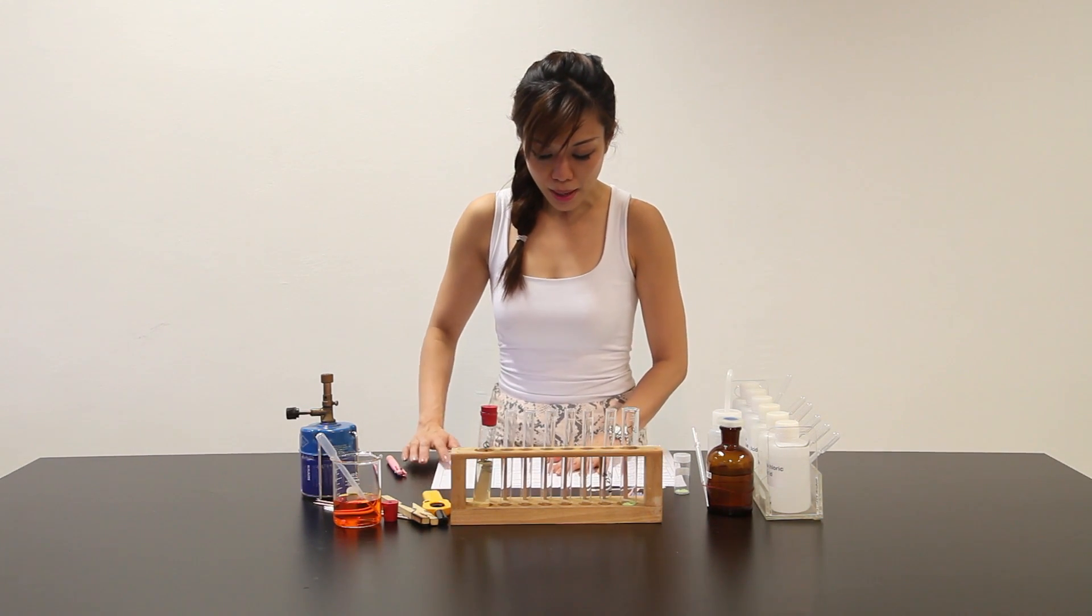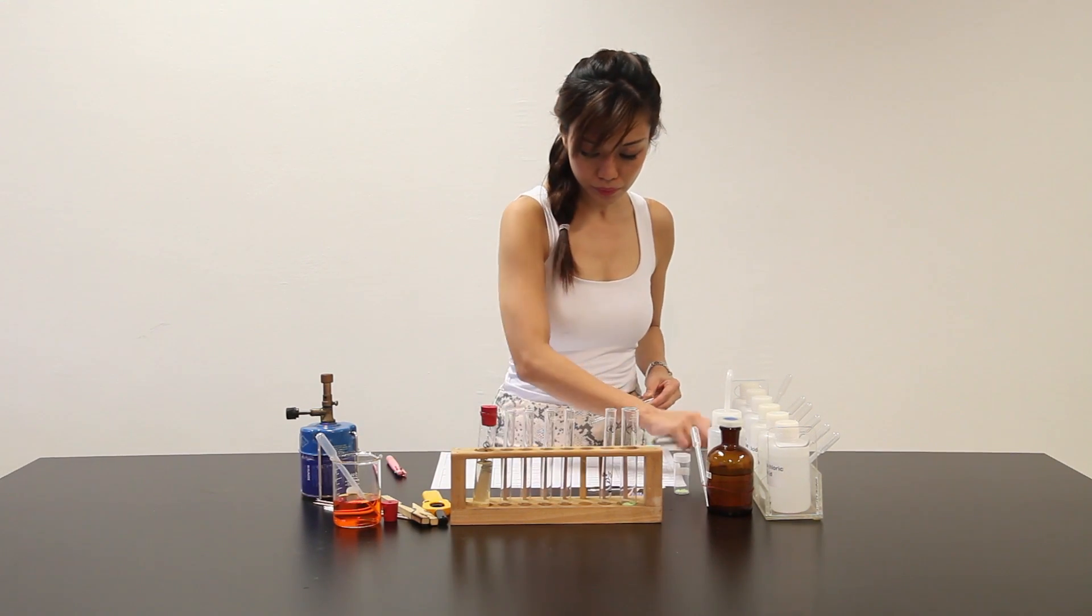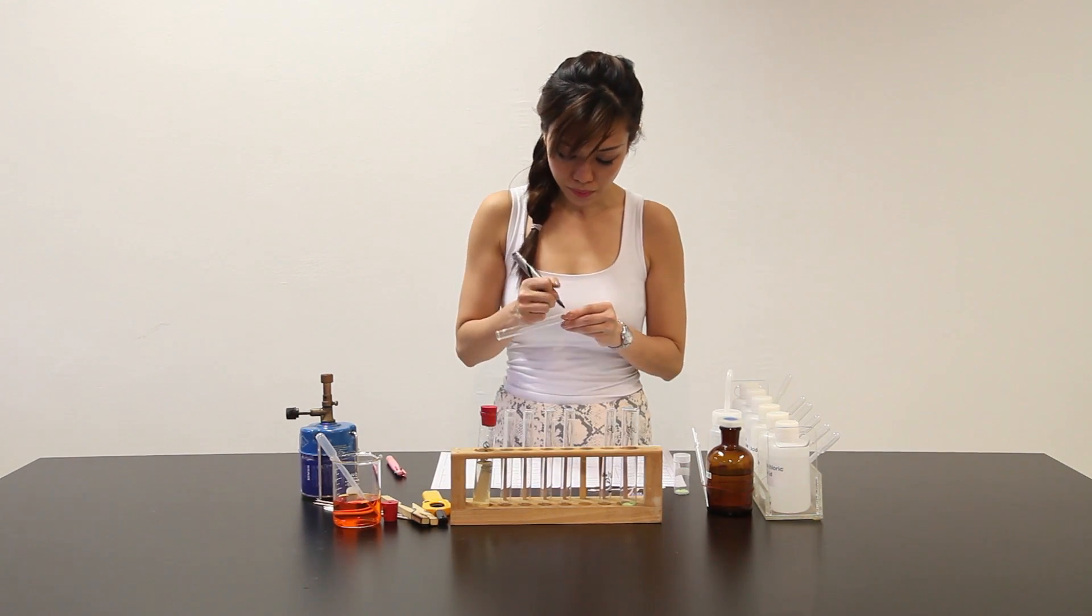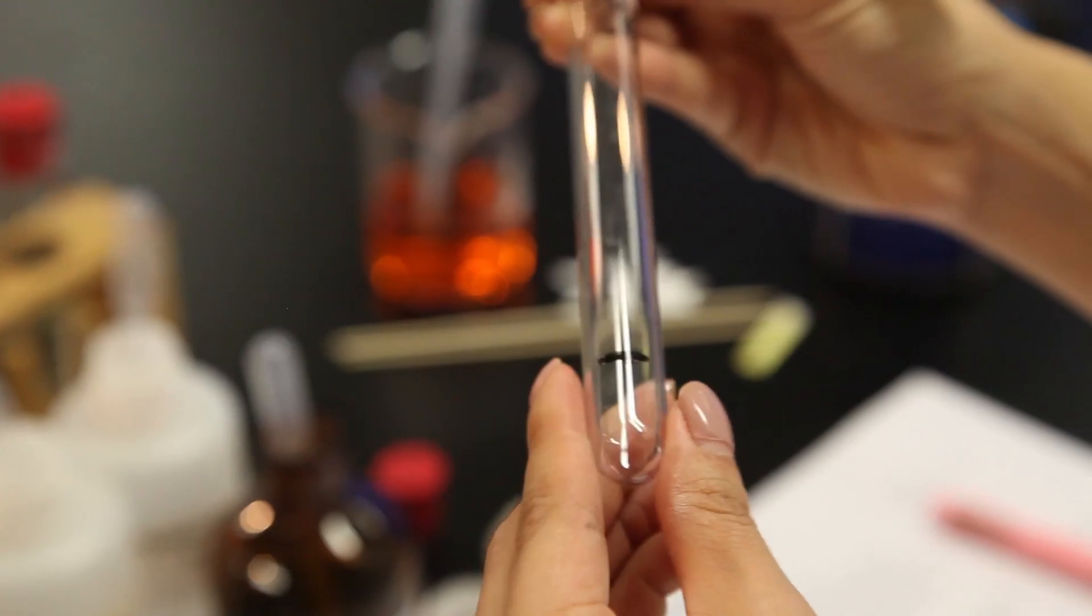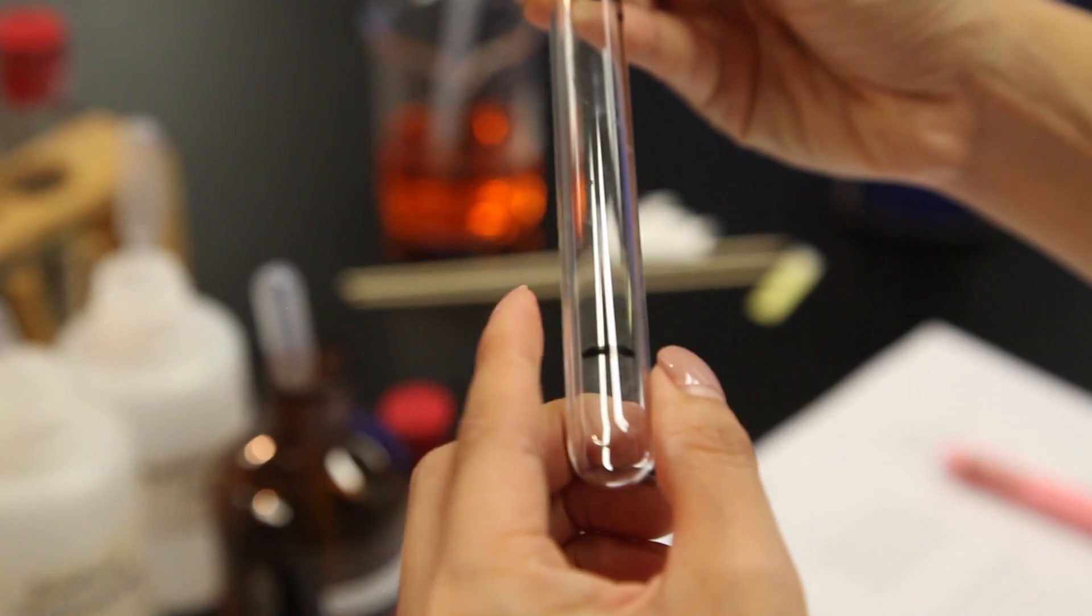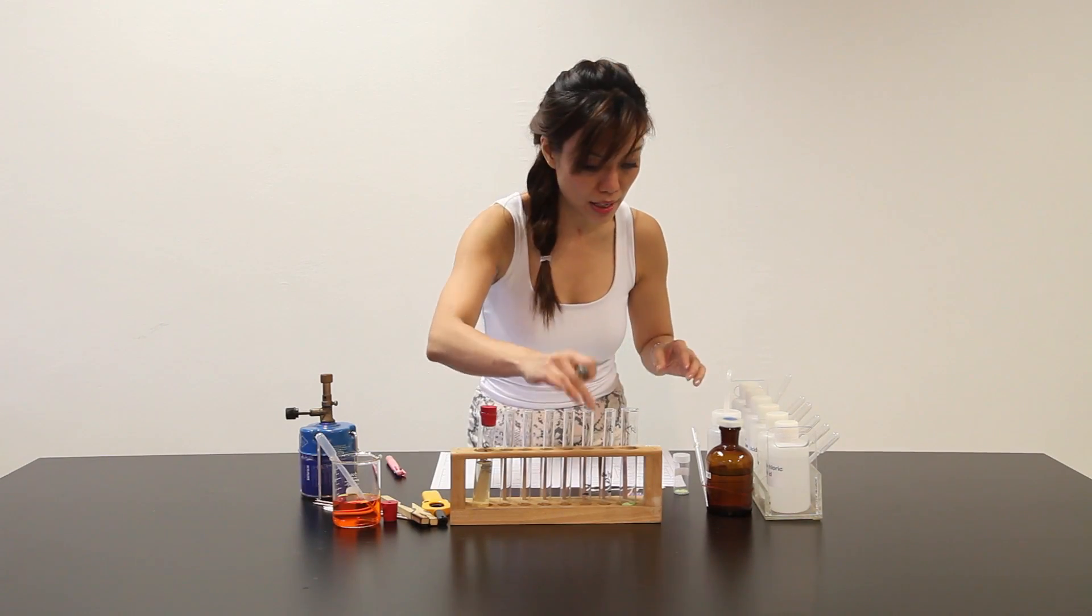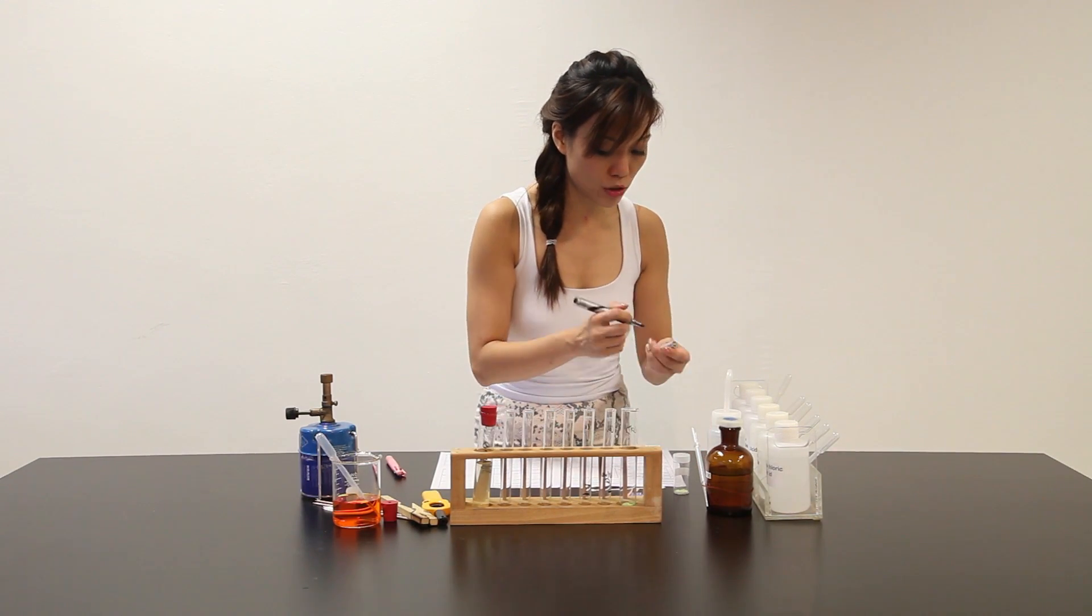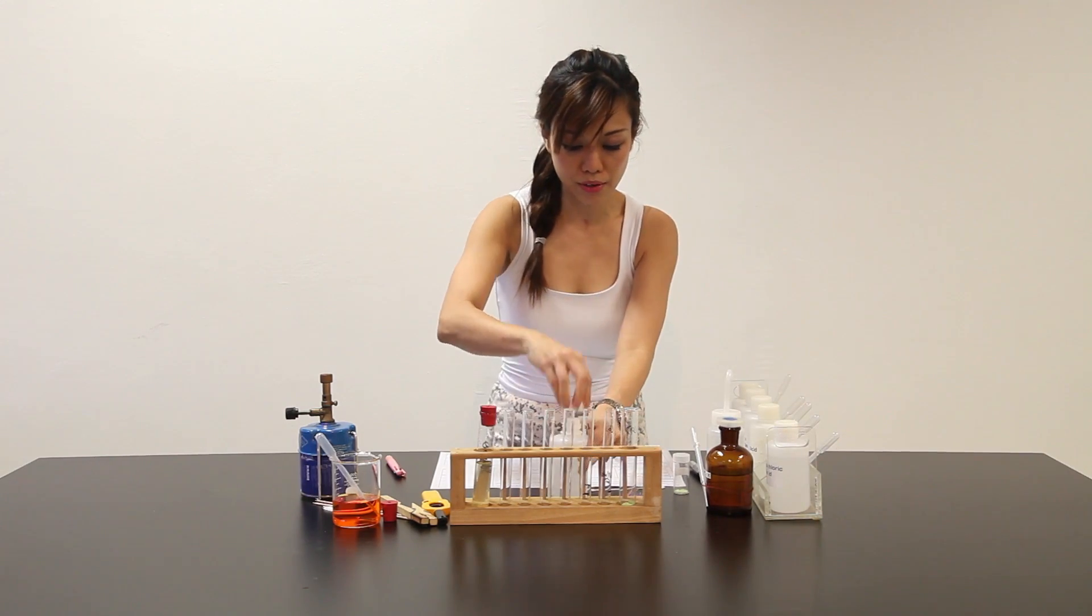So let me move on to part C. Part C here says place about 2 cm3 of Solution Q into a clean test tube. And to this solution, add another 2 cm3 of NaOH. So 2 cm3 of 2 cm3, I have marked already. And they want NaOH. So let me place NaOH, which is here, right in front of me.